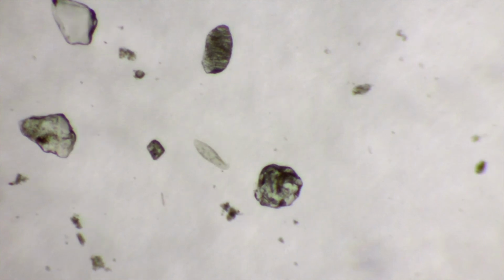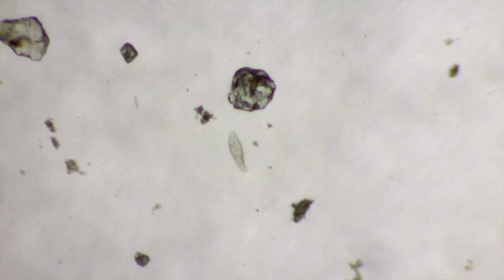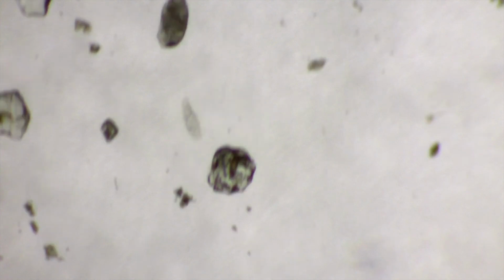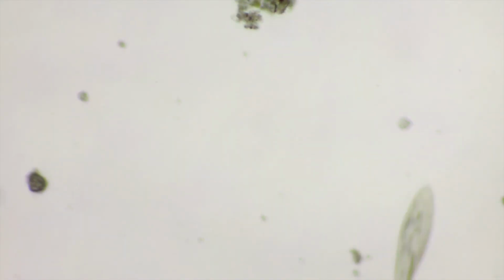At first look, I believe this to be the infamous Paramecium caudatum. Upon further examination, I determined it was in fact not a Paramecium, but still a ciliated protist, and with a distinctively hooked oral cavity. Due to this and the fact that my sample was collected from freshwater sediment, I've classified this organism to be a Loxodes.